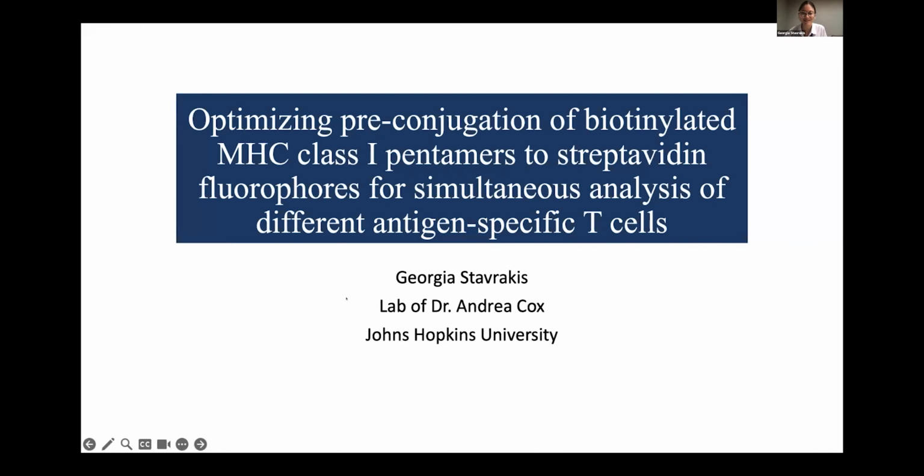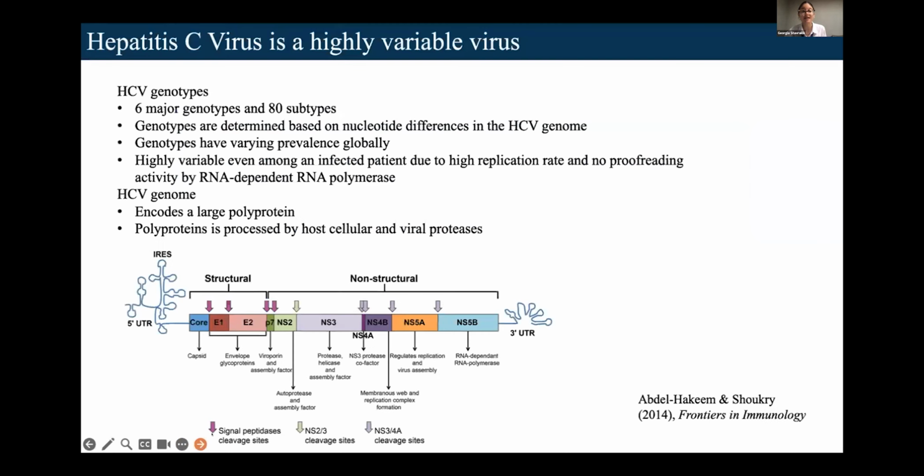All right, sorry for the mouthful of a title. Thank you so much to ProImmune for inviting me to speak today about some of the work we've done with their MHC class I pentamers to study CD8 specific T cells in different viral infections. However, today I'm going to mostly be speaking about HCV. So I just wanted to do a quick introduction to hepatitis C virus, HCV, and some important factors about HCV that led us down this optimization pathway.